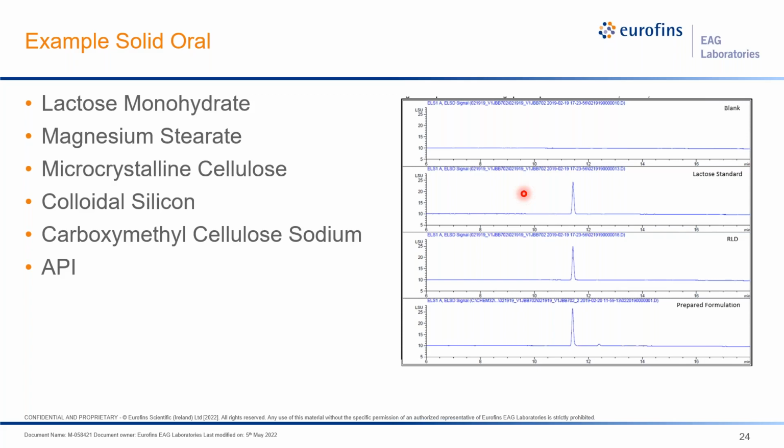It's those three in the middle: the microcrystalline cellulose, colloidal silicon dioxide, and carboxymethylcellulose sodium. And the reason is they're not soluble. We're not going to be able to separate them through solvents. We're not going to be able to separate them through any of our different testing techniques.